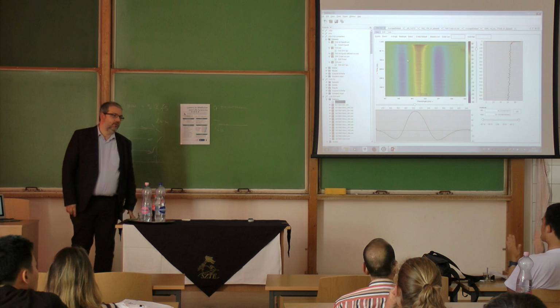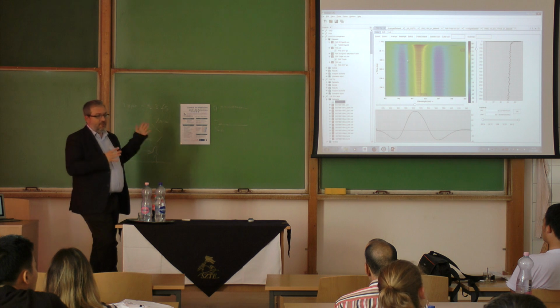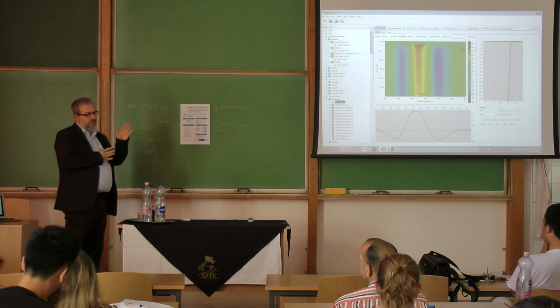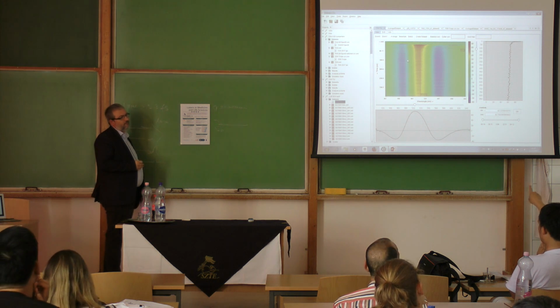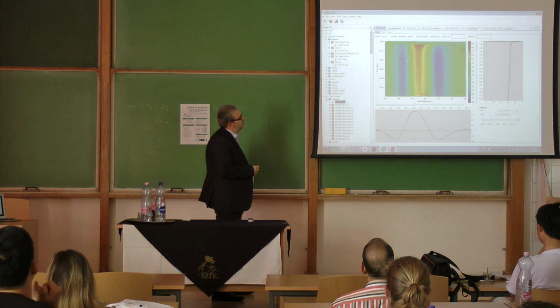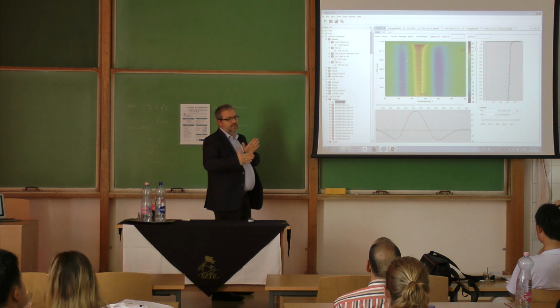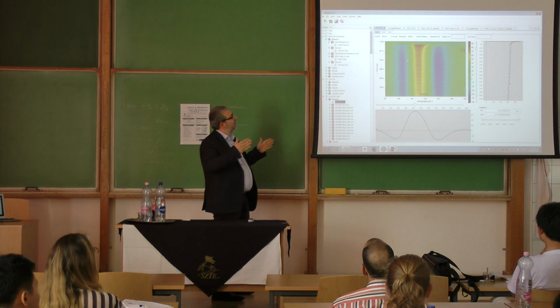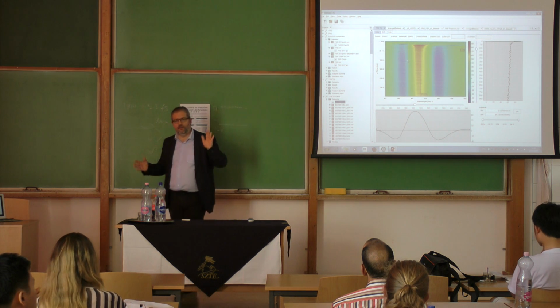This is a time delay, because the delay stage makes the time delay, of course. When we know where we are at zero time, we set in the software that this is zero. We know when the zero is; actually, you can see it. And we set the difference between the pump and the probe with the delay stage, and this is what you are measuring here: the time difference between your probe and pump.